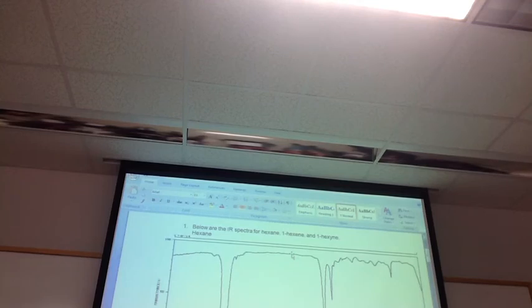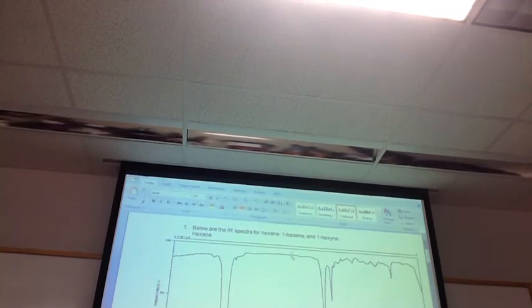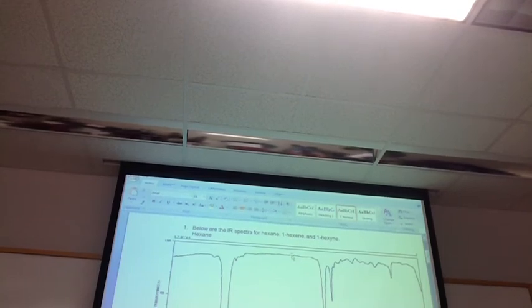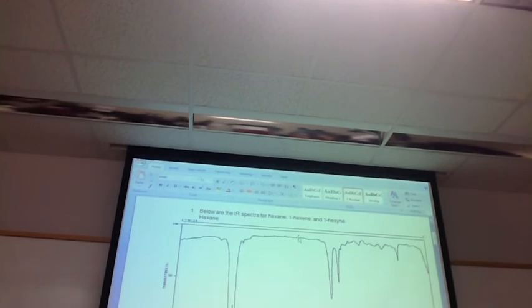Why do you have 2 different peaks? In the guideline sheet that Dr. Nichols gave you, it shows 2 peaks, right? And remember, Alex demonstrated that there are different things our bonds are doing, right? So one of them will have more energy than the other. Not all of them have different peaks, but CH stretches have 2 peaks, one at a higher frequency and one at a lower frequency.